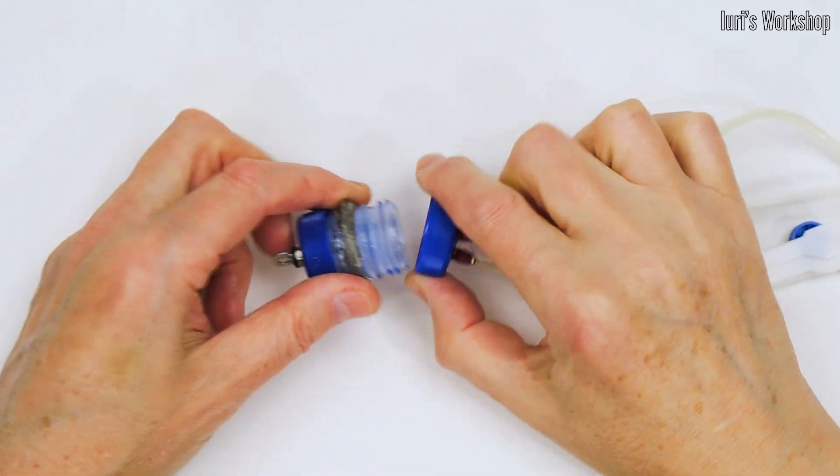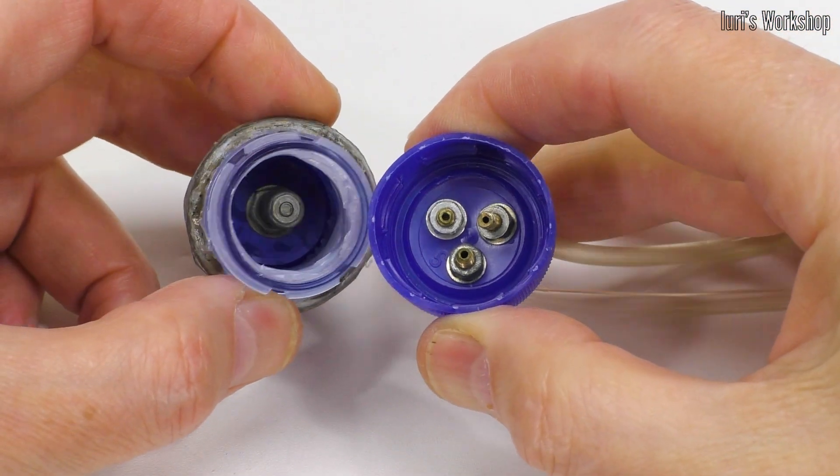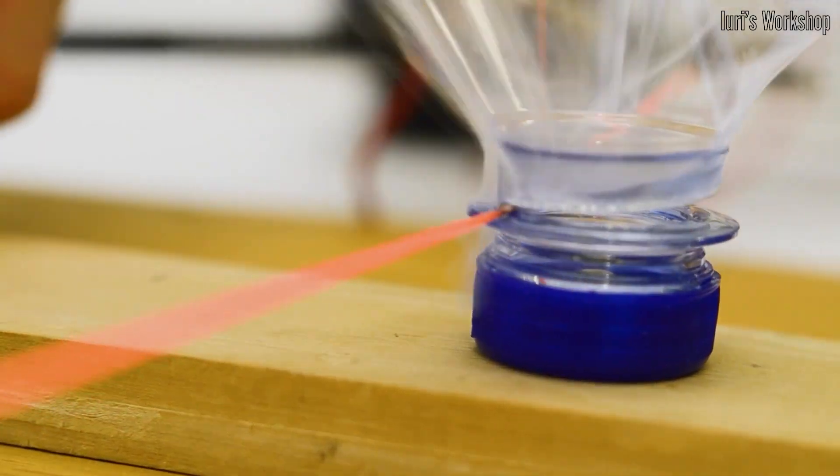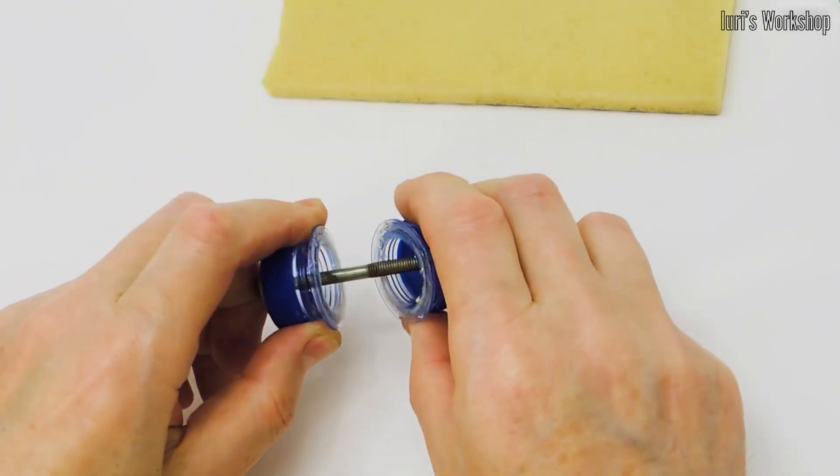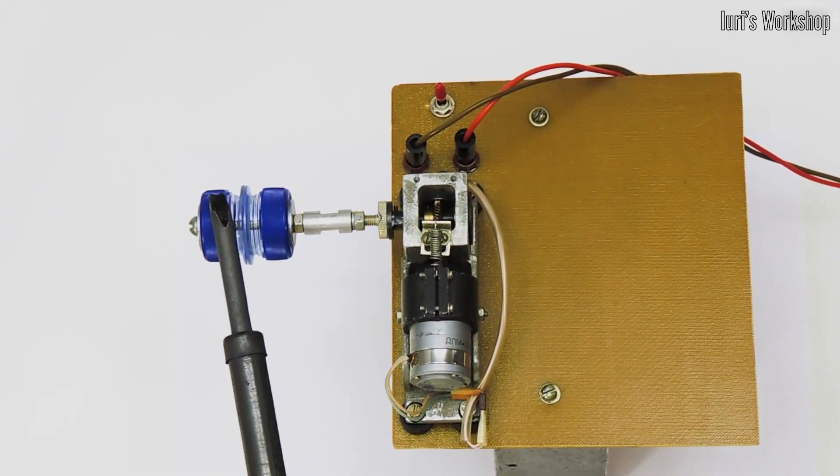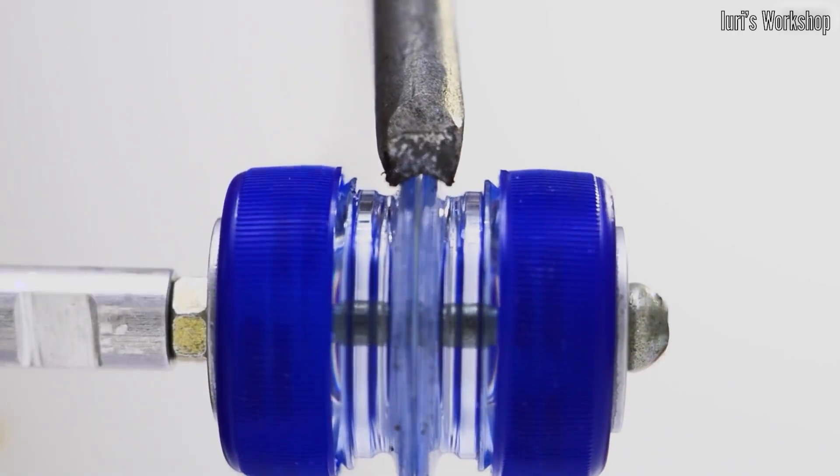Let's go over some of the details of the reactor design. I made this universal coupling unit from two necks from polyethylene terephthalate bottles. I welded the bottle necks together and then reinforced the welding seam with copper braided from cable.